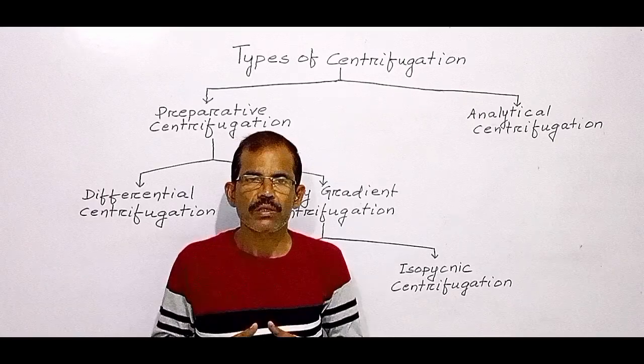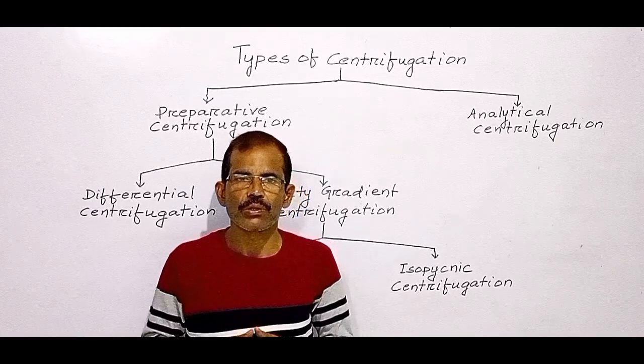Today we will discuss different types of centrifugation.